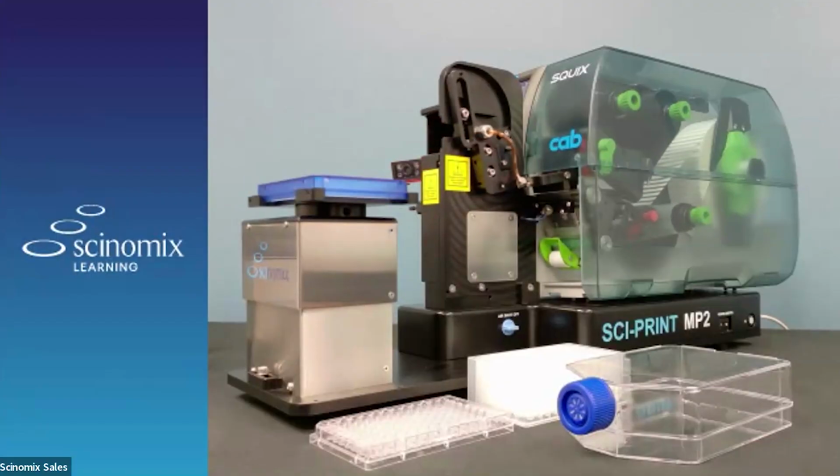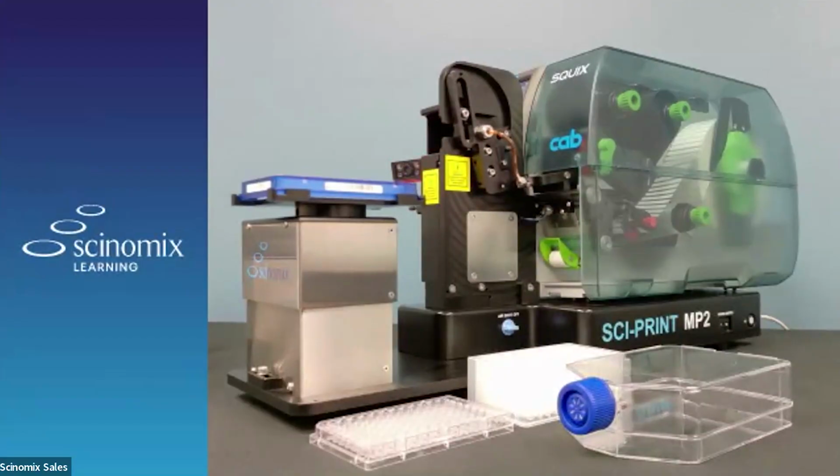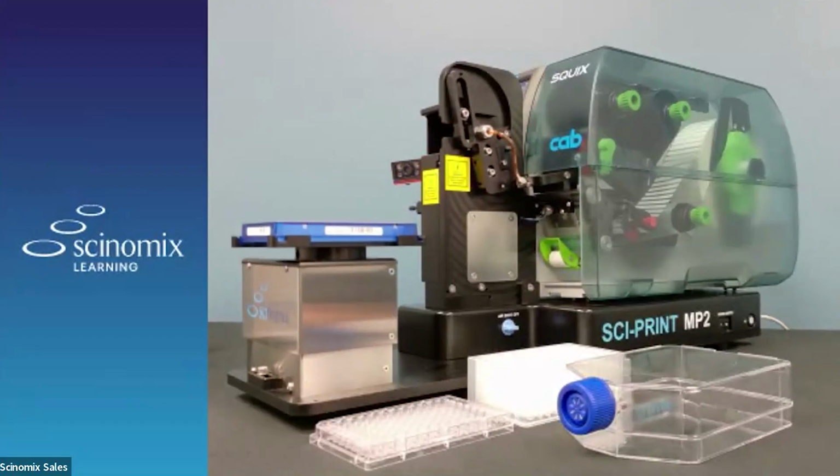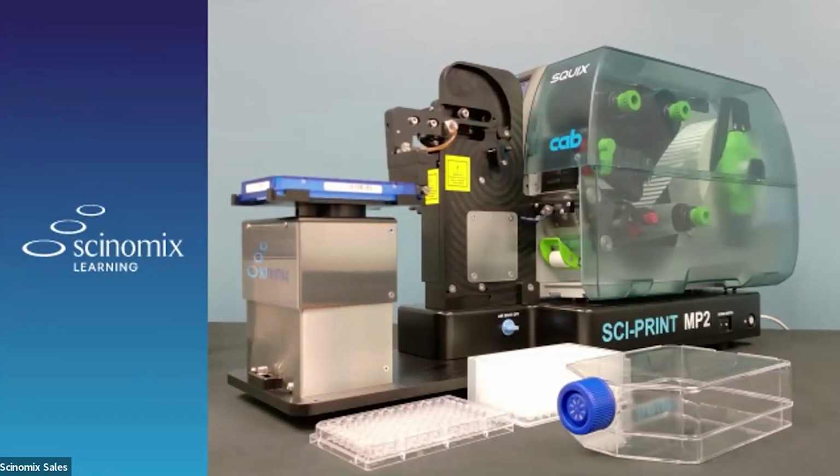And we are printing and applying on the second side. You see the barcode scanner flash. And we'll continue this on all four sides. And then that plate nest is brought back down for any integration arm or things to come and pick up the completed plate. We'll go ahead and do it one more time just for repetitive sake.